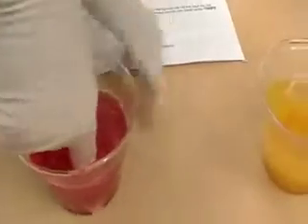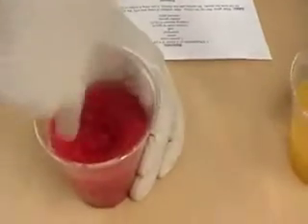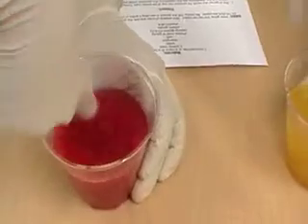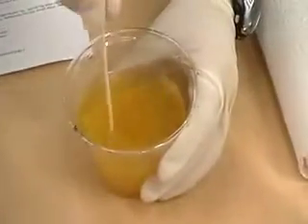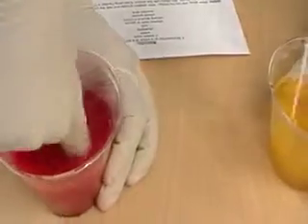And then very gently, we can just use a finger, or Ron can use a popsicle stick, and we just gently mix these together. And you don't want to be too vigorous at this step because we want long, gooey strands of DNA at the end.